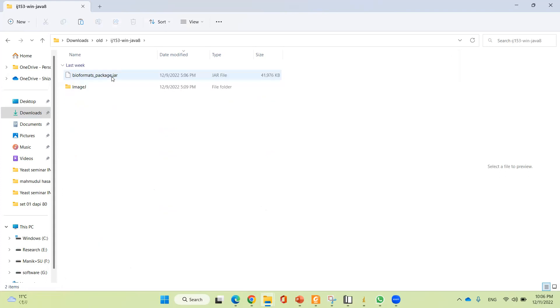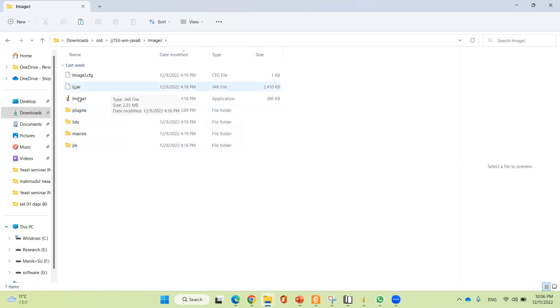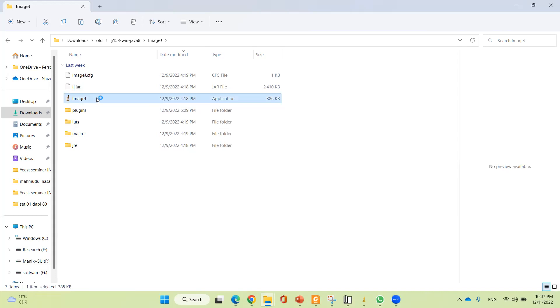After extracting it, it gives you the extracted files. From these files, you have to click on the ImageJ executable. After clicking, it will open.